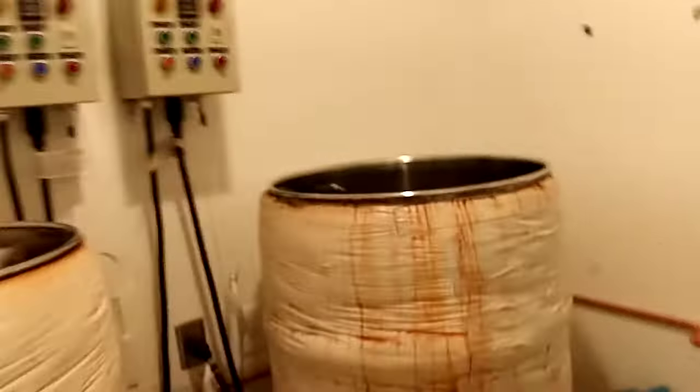Matt from liquidfungi.com here checking out our atmospheric steam sterilizers. These are some systems that we built — we built a couple of these a few years back.